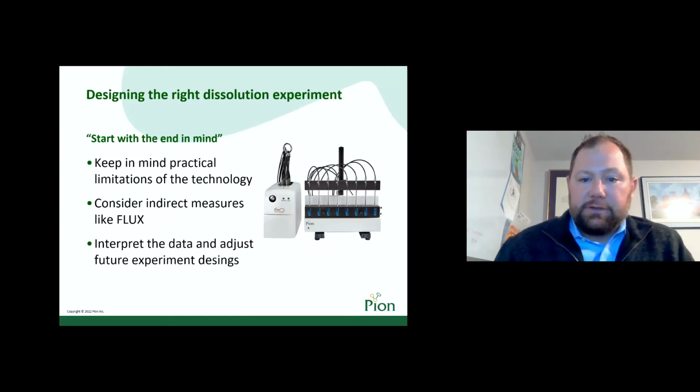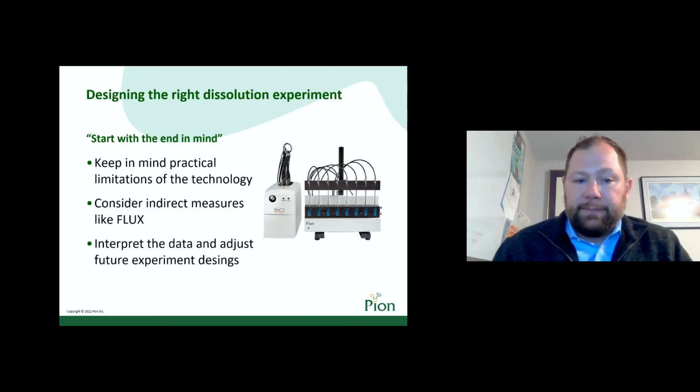When implementing a dissolution assay early in the pre-formulation process, you are going to have to think through your design of experiment in order to get the most utility out of any in situ system. I am a big fan of the mantra, start with the end in mind. If your target dose is 1 milligram per mil, if your solubility is less than 10 micrograms per mil, you're going to have a ton of excess solid in your test vessel. Think about what you are really trying to accomplish and consider alternative experiment designs.